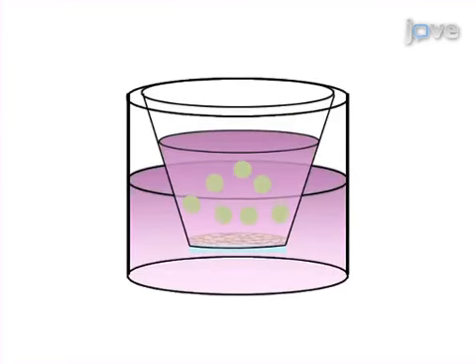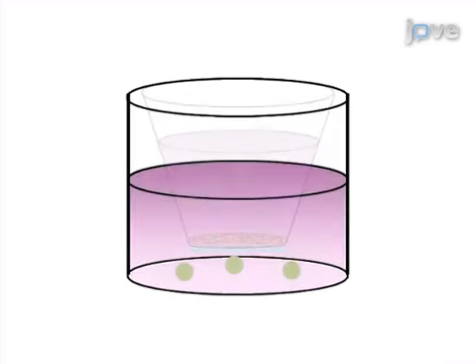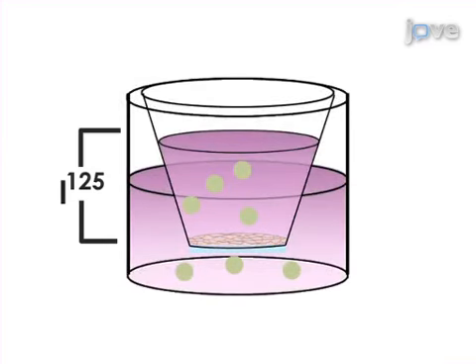The carriers are then added to the apical chamber above the cell monolayer. After incubation for varying time points, carriers are collected from the apical chamber, the basolateral chamber, and the cell monolayer, and tested for potential degradation of the labeled component. Nanocarrier transport across the cell monolayer is then calculated.